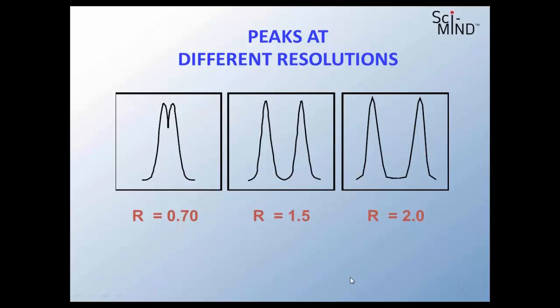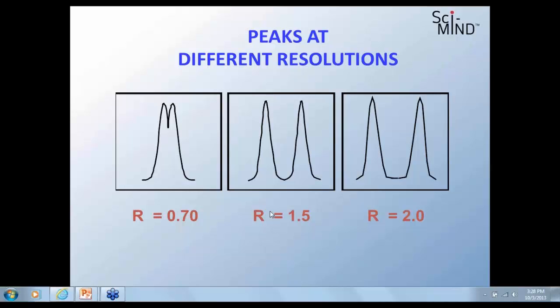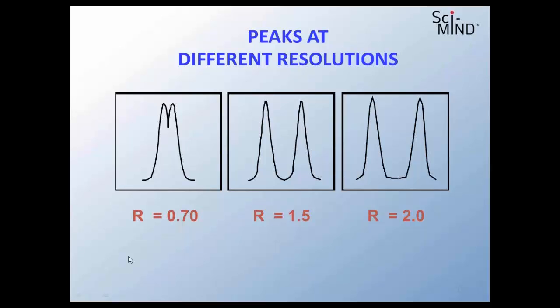Oh, we've got a discussion on HPLC and UPLC coming up. It says here UHPLC and HPLC only differ by capital cost, because ease of use is equivalent. Columns from UHPLC can be employed on HPLC systems with proper consideration of methodology, and I'm not going to argue with any of those points. So I agree with all of that. Thank you for the discussion.